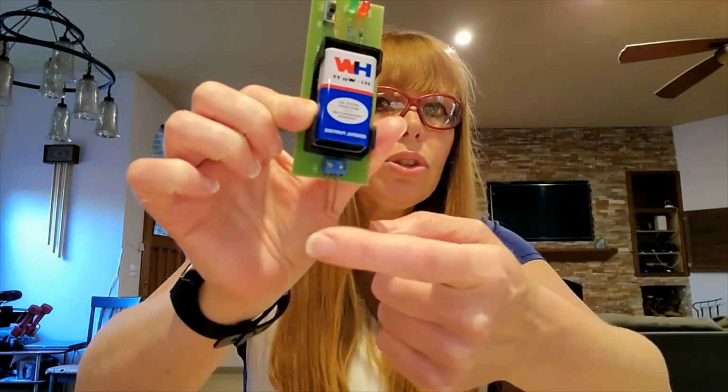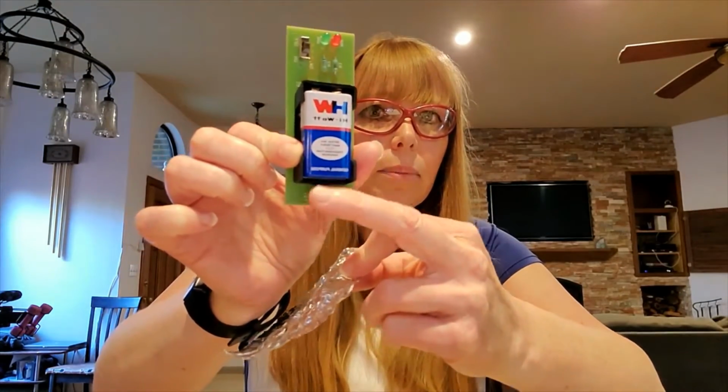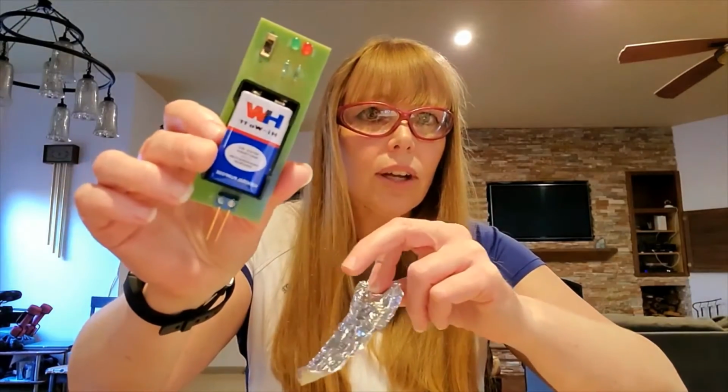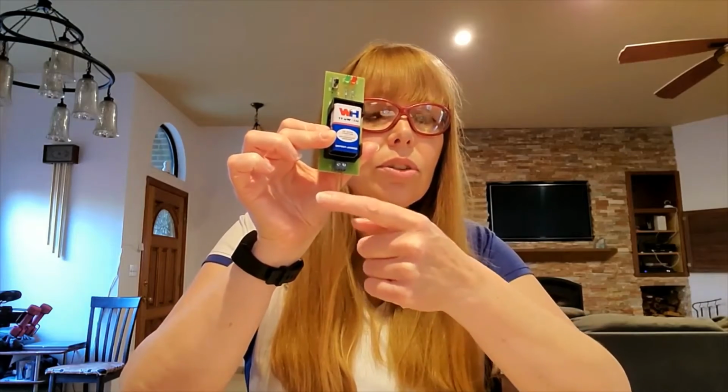So what we're saying here is, remember that the flow of electrons, so the electrons come off the battery, they go down one side of the probe, and then they go through the solution or the metal, and then they go up the other side of the probe, and then they make the light bulb light, because there's some circuitry stuff wired in here, okay? So if we have a solution that conducts electricity, then we're gonna have the positive or negative ions that are going to allow the liquid to carry the charge through the liquid solution up and over.